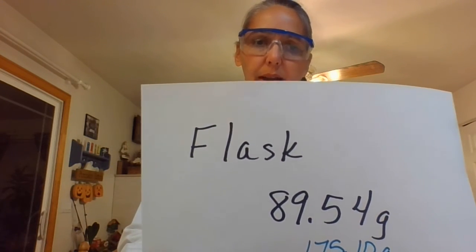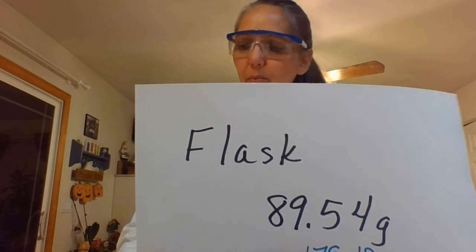And I remass that, and now the new mass is 175.10 grams. Okay, so that's my new mass of both the water and the alcohol. So it's 175.10 grams. All right, so that is the water and alcohol lab.